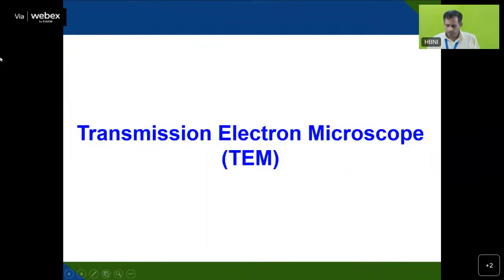So now we'll go to the discussion about the transmission electron microscope.